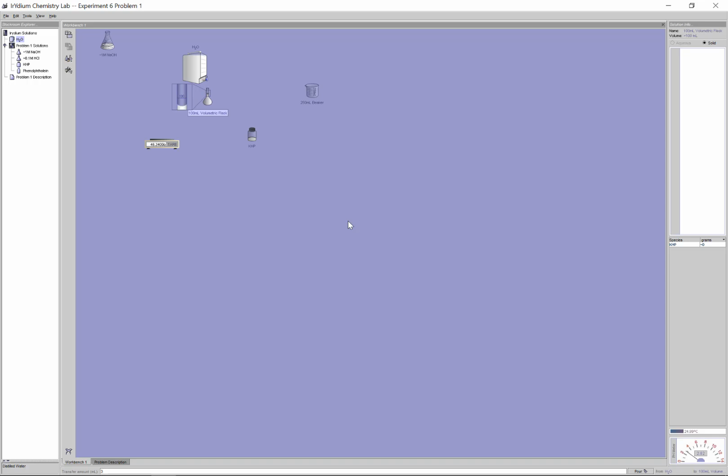And then as I get up close to the top, well, I'm actually really, really close to the top. Maybe I only want to add 1 mL at a time. In this case here, I actually want to just probably even use the eyedropper here. I don't want to overshoot it, or else I would need to make the solution again. Maybe I want to transfer in 0.5 milliliters here. Watch this line rise a little bit here, maybe even less than that, 0.1 milliliter. I want to make this so that the bottom of the meniscus is perfectly at that 100.